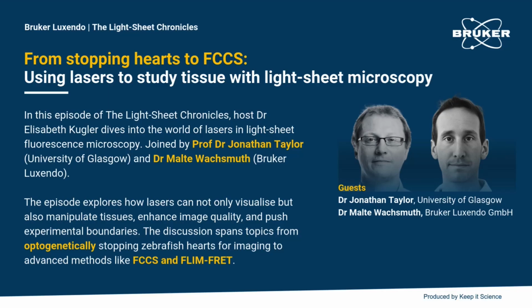And the major challenge of FCS is that it's a point spectroscopy method. So it's originally based on a confocal setup, like you know probably from a confocal microscope. So you park your beam at a spot inside. Initially, it was mostly used as an in vitro analysis technique, but it is as powerful in vivo, inside living cells and living tissue, as it is in solution. And so you park your beam at a spot, and then you observe molecules as they pass by diffusion or also flow.